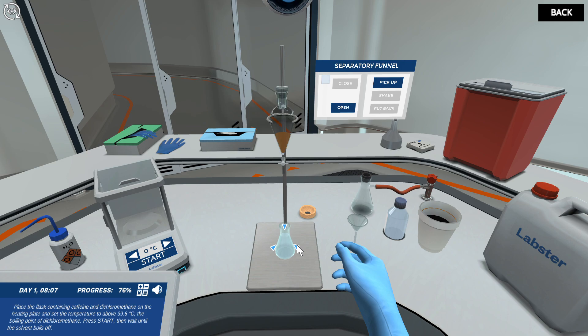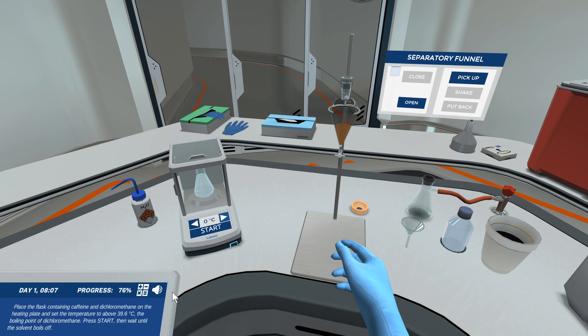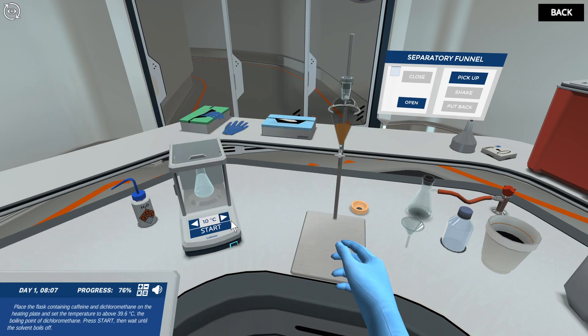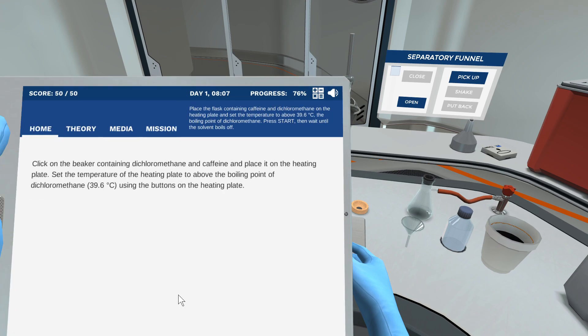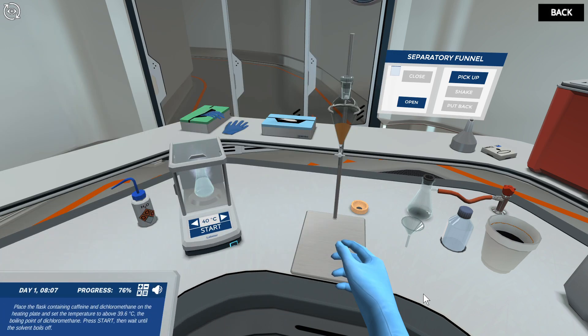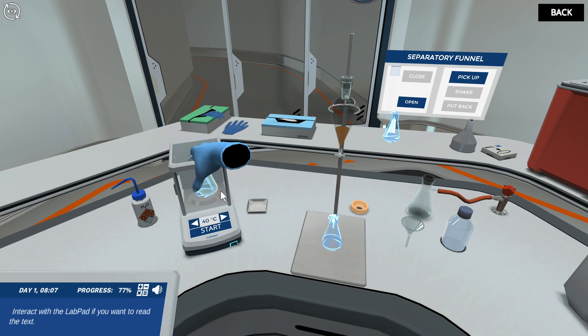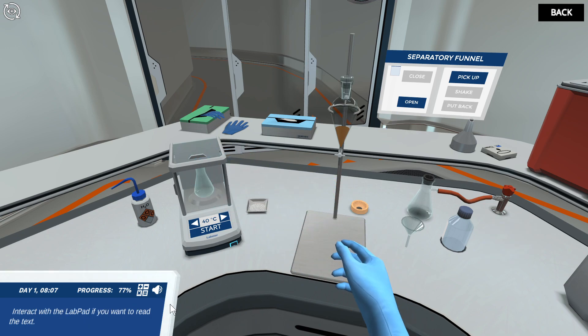Place the flask containing caffeine and dichloromethane on the heating plate and set the temperature to above 39.6 degrees Celsius, the boiling point of dichloromethane. Press start, then wait until the solvent boils off. Great work! Now transfer the extracted caffeine to the weighing dish. Hover your cursor over the weighing dish to read how much caffeine you extracted.